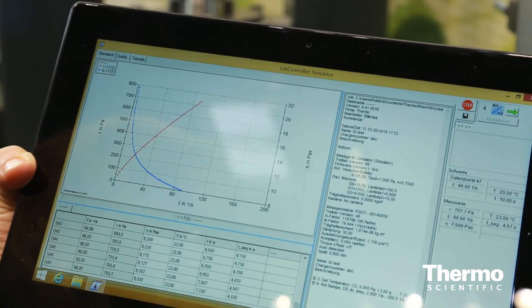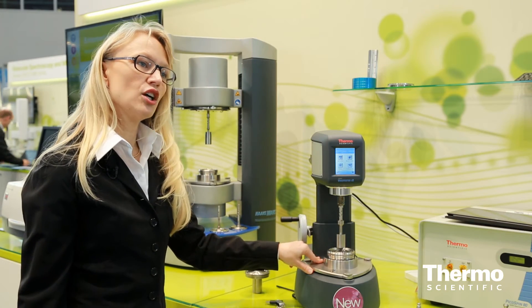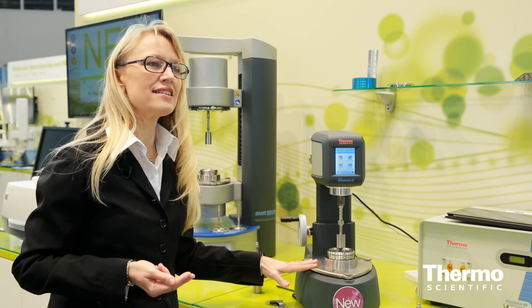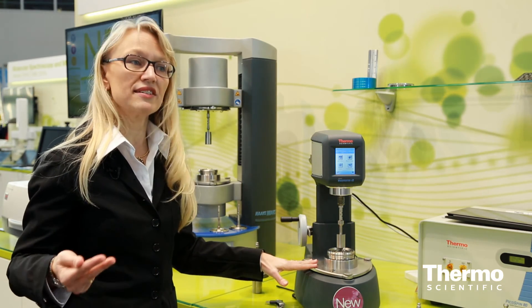The measuring geometries and the temperature control system are equipped with the so-called Connect Assist functionality. Last but not least, we have a new functionality called Temperature Assist, which is available for the Peltier element and guarantees very fast temperature control of the real sample temperature. For more information, please visit thermoscientific.com/ViscoTesterIQ.